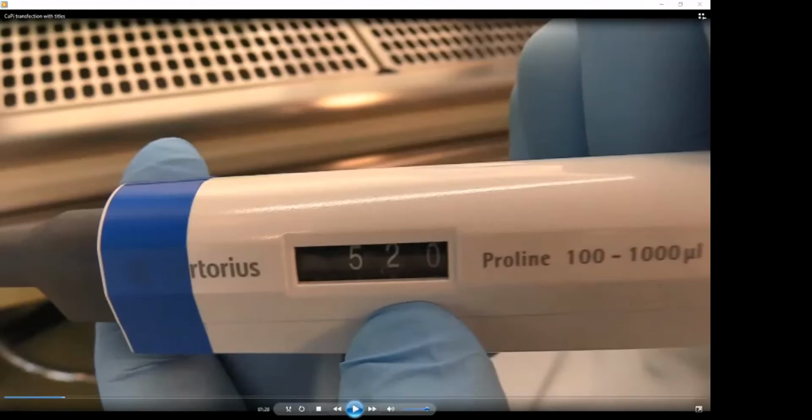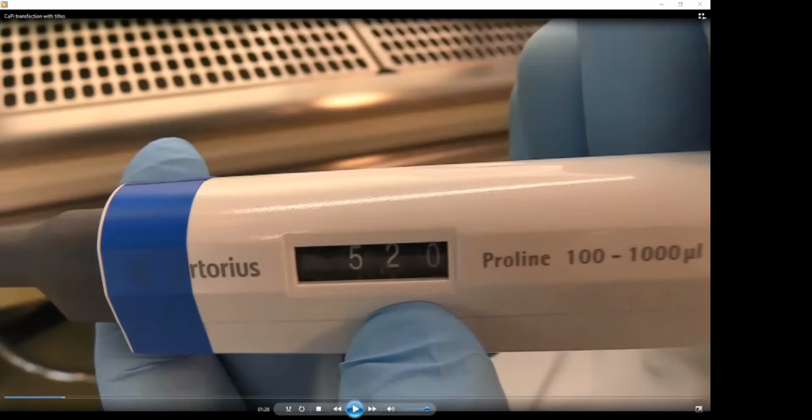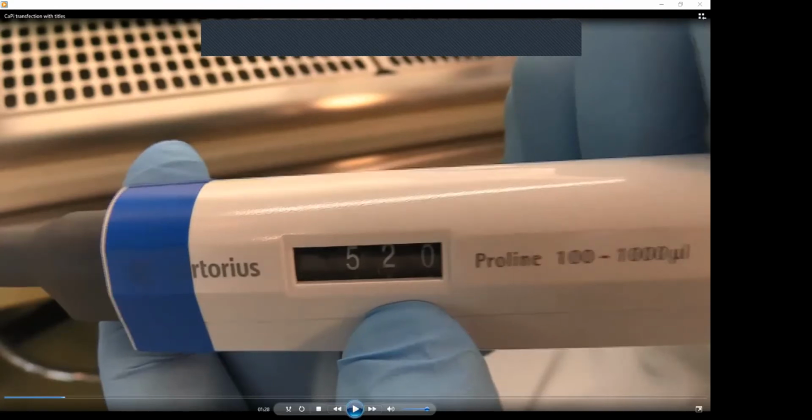In case of the HEPES buffered saline, it's 13 times 40 microliters, it's 520 microliters. And this solution we call solution A. It is also important to notice that in one step we will mix together DNA with calcium chloride together with this HEPES buffered saline, and there it's necessary to know that we have labeled this HEPES buffered saline as tube A.